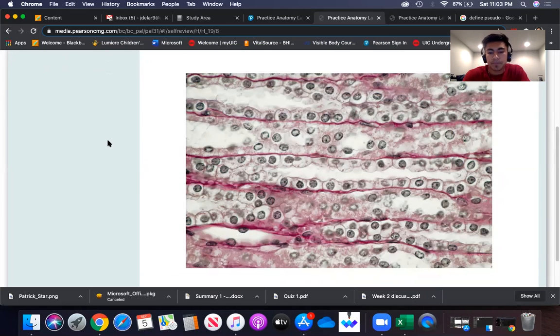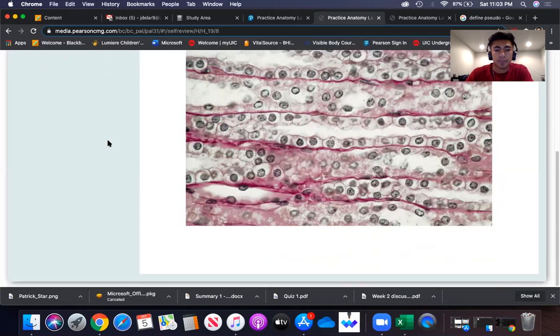If you look here, openings, border. This border is made of very consistently shaped, same size epithelium cells. This is how you know they're simple cuboidal. It is one layer attached to the basement membrane, and all the cells are about evenly shaped all around.